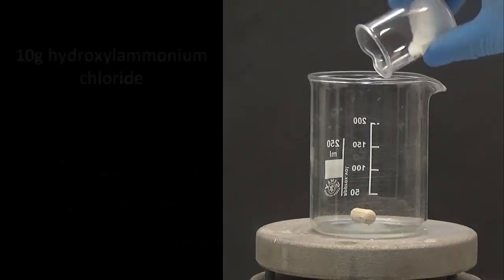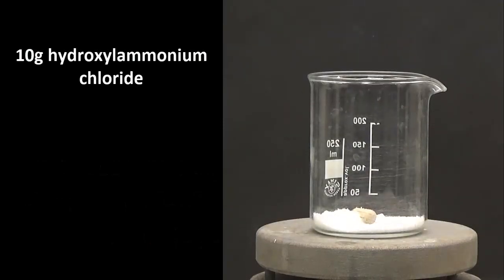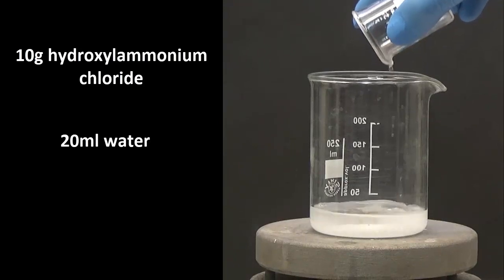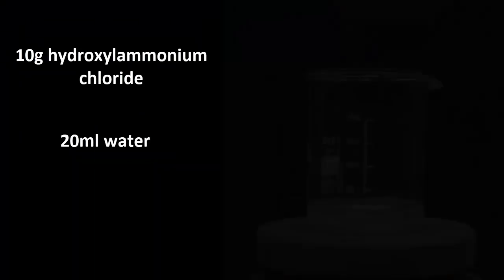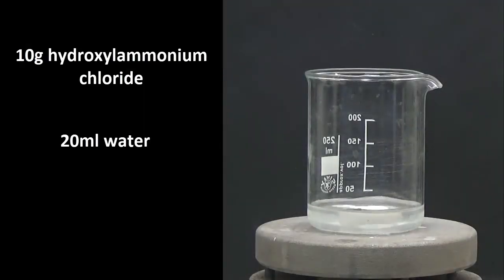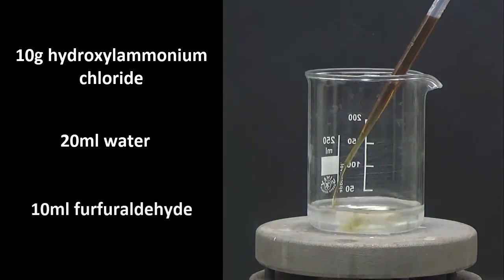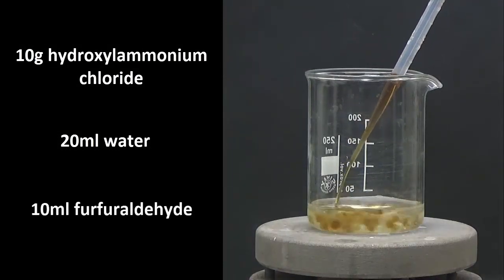To proceed, we will dissolve 10 grams of hydroxylammonium chloride in 20 milliliters of water in a 250 milliliters beaker. When dissolved, add 10 milliliters furfural with strong stirring.